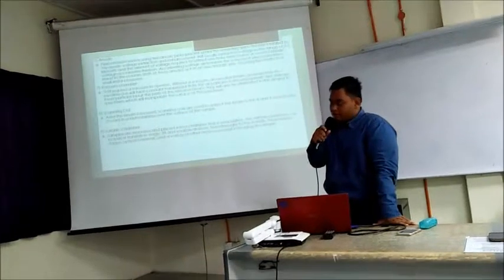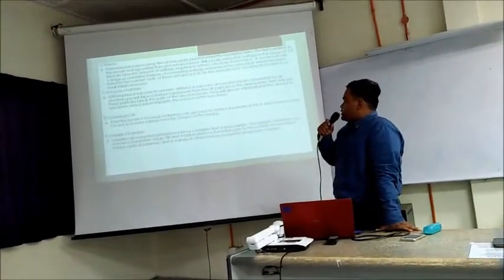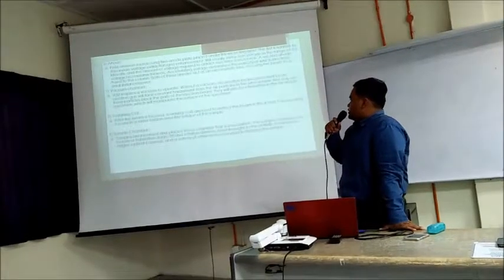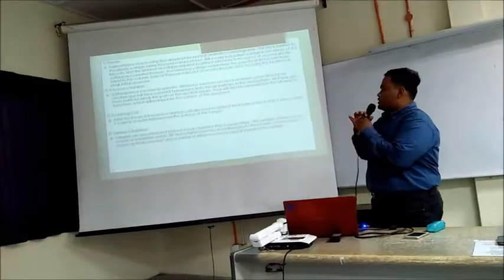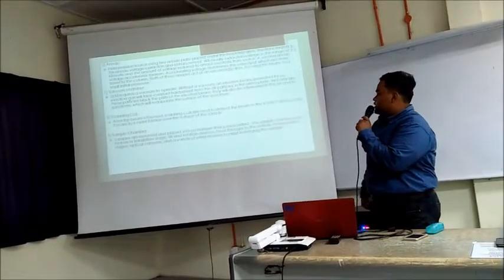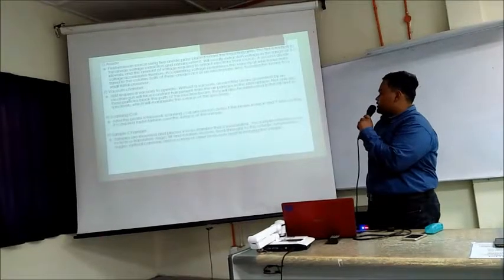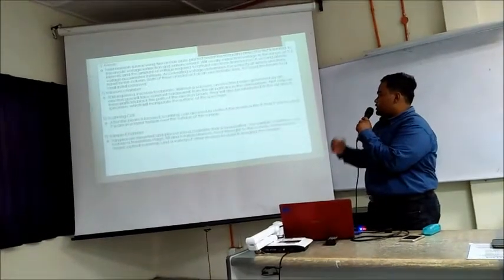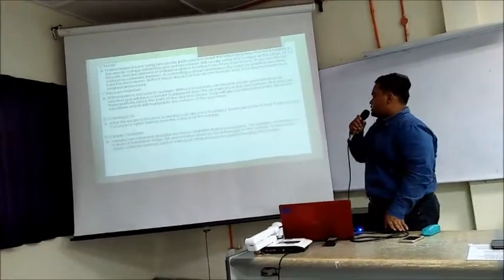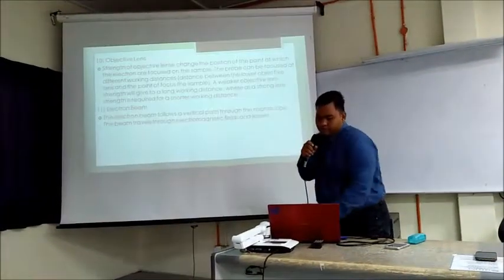Number 9, sample chamber. Samples are mounted and placed into a chamber that is evacuated. The sample chamber can include a translation stage and rotation device, feed through the outside, temperature stage, optical cameras, and a variety of other devices to assist in examining the sample.